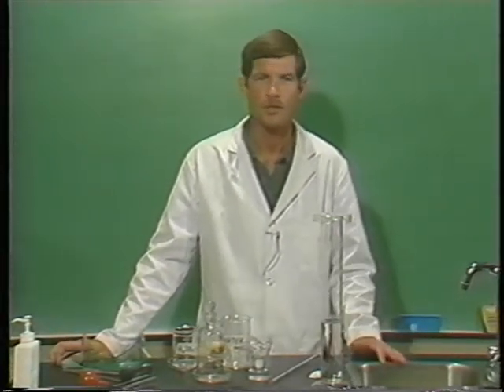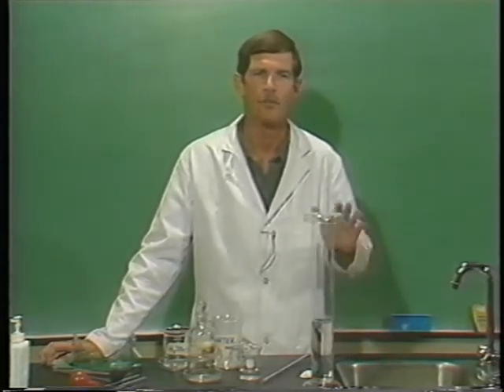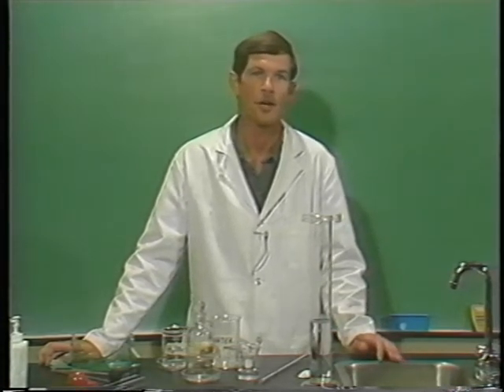Water is the universal solvent, and if you contaminate your skin or your clothes with just about any chemical, the best thing to do is to wash the area with water. And usually they say about 15 minutes is a sufficient amount of time.